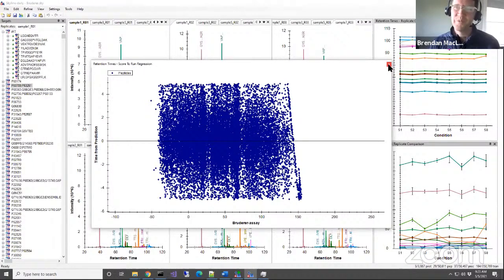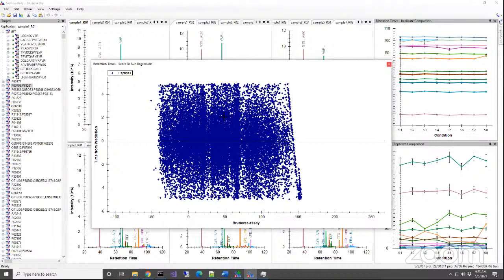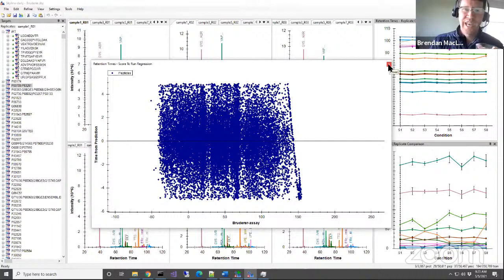And that's the hope, since I came up with all the parameters before we started and guided you through them. But if you find issues when you're looking at this yourself, it may be a reason to switch your parameters.